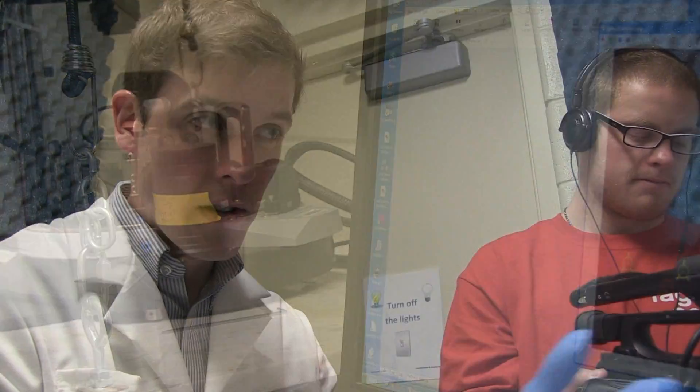So what we have here is an example of a silk thin film that's only 50 nanometers thick. That is just as strong as other spider silks, much stronger than any other silk films that have been made so far. And that would vastly increase its applicability and its different uses.